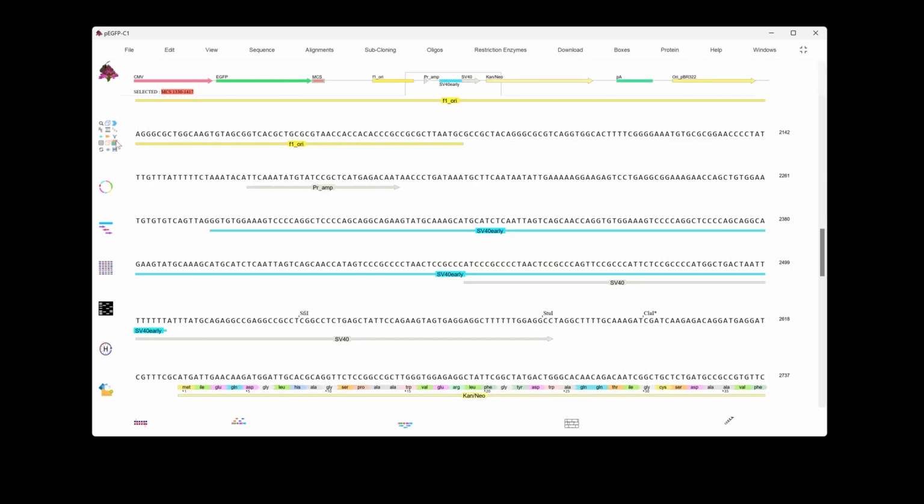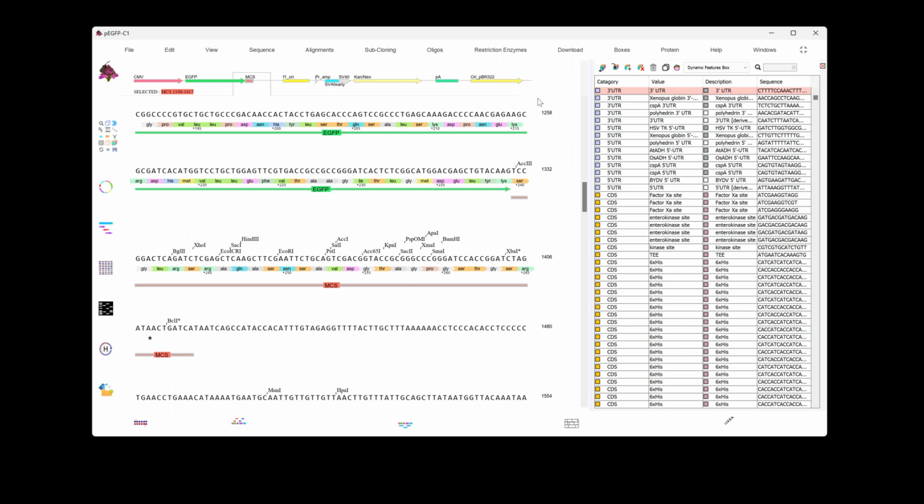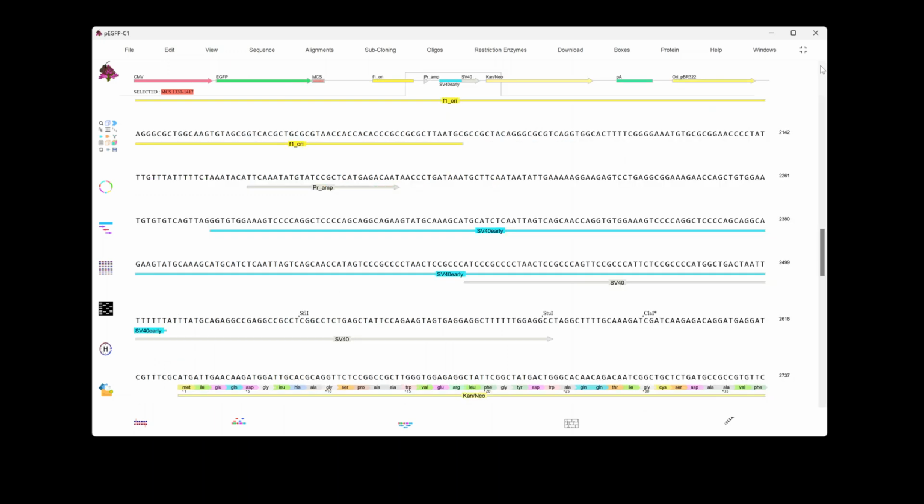The multicolor shortcut button opens the Features box. The default Features box contains sequences commonly found in the Add Gene collection. A common use is to search your sequence and auto-annotate found features. You can also create custom features boxes containing your favorite features. The next three shortcuts refresh the display, capture the display, and save changes, respectively.